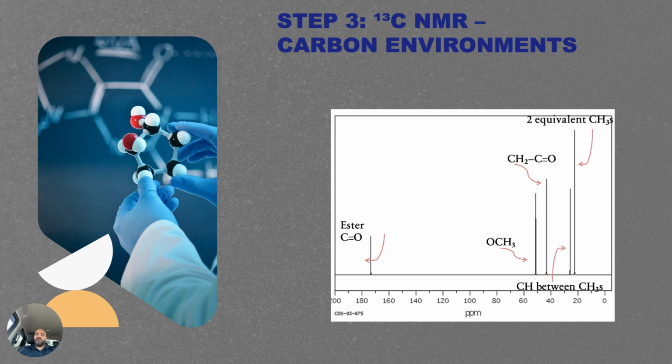Other peaks align with a CH2 near the carbonyl and a branched alkyl chain with 2 methyls in the same environment. This symmetry, along with the ester evidence, suggests a branched chain ester rather than a linear one, such as methyl pentanoate.